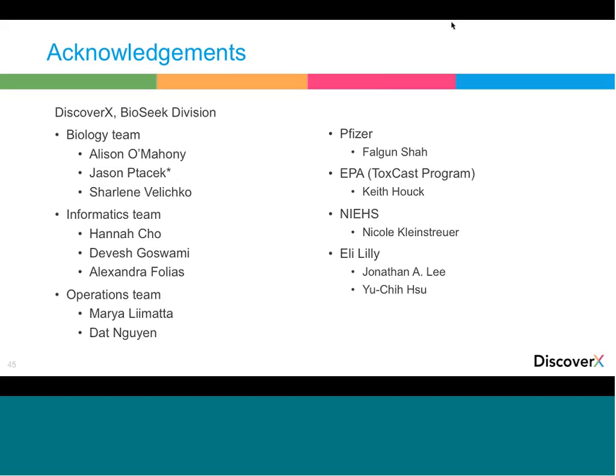In terms of the tox alerts or toxicities that we're looking at, we are actively developing signatures in a couple of different areas. Cardiotoxicity is one area that we're working on, gathering information from our clients and interested academic collaborators on compounds and drugs that cause different types of cardiotoxicity. We've not really focused on arrhythmias, but on other types of cardiotoxicities. And we're actively interested in people's contributions to that project, so keep that in mind.